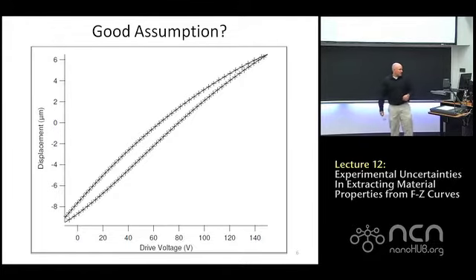If we do our calibration over the entire dynamic range and just use this part of the curve, well, then we're going to get an error. If we, say, do our calibration up here and then use this part of the curve, well, it's going to be a little off. But generally speaking, it's probably not a horrible assumption. It's reasonable, a 10% sort of issue, maybe.